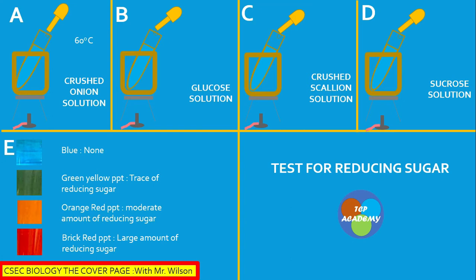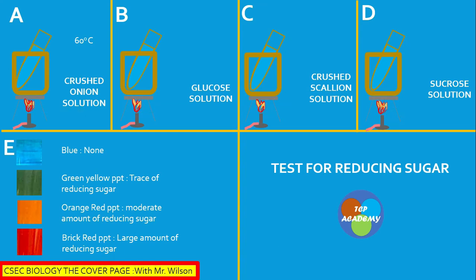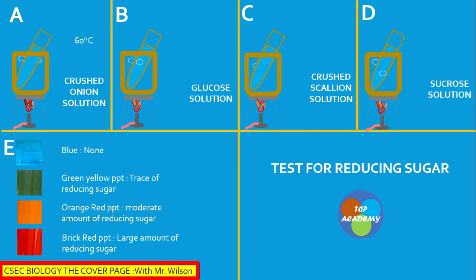We are going to add Benedict solution to the mixture in the container, then heat it to a boil. Temperature must go above 60 degrees Celsius. Pay close attention as we expect the color in the boiling tube to change as the experiment progresses. You can see the water boiling outside the test tube in the water bath.